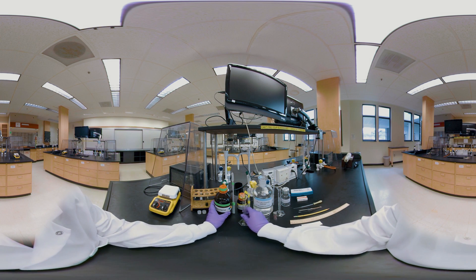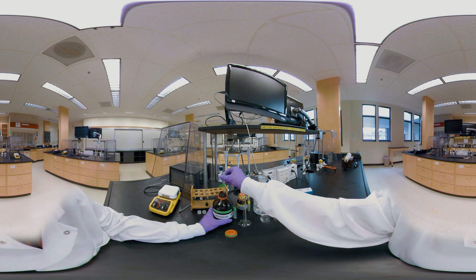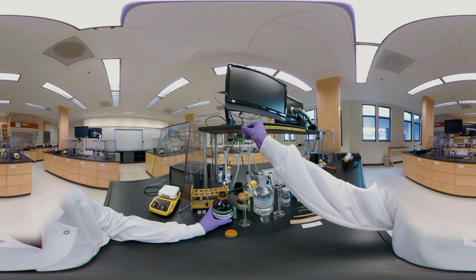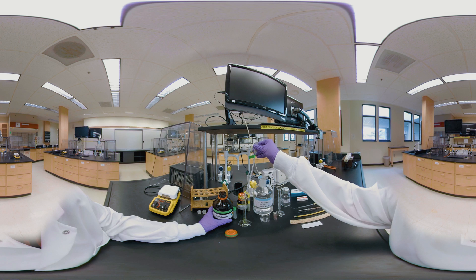Add six milliliters of pentane. Cap the test tube and shake vigorously for one minute.